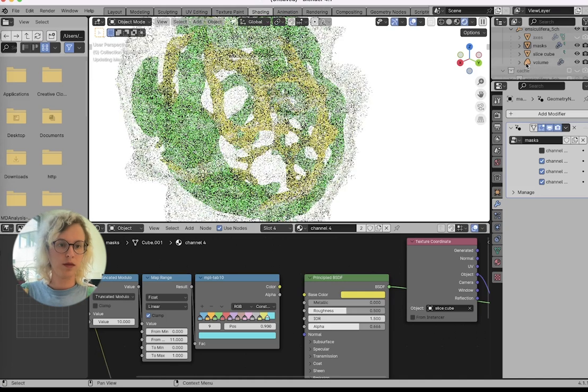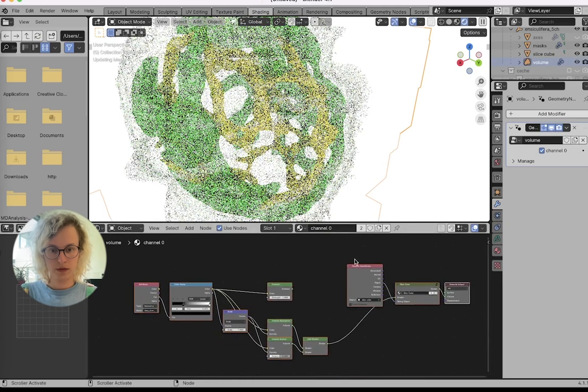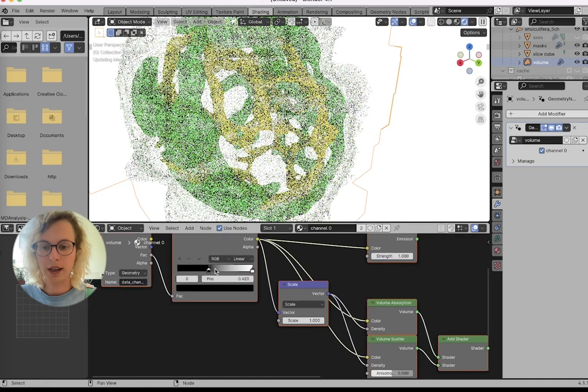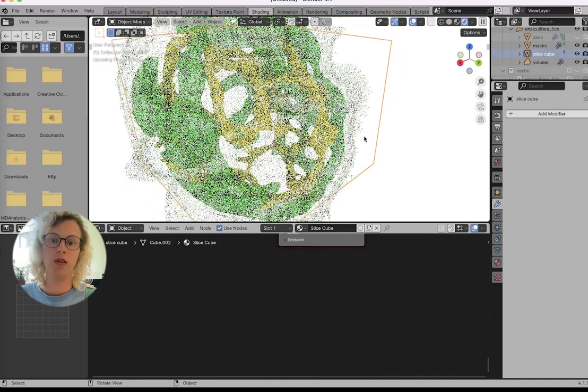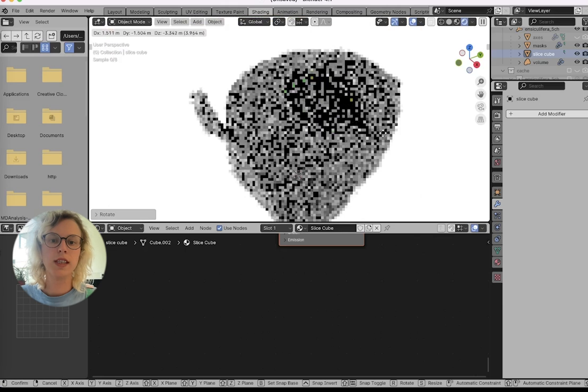So if we turn the volume back on, we need to redo its shading as well. Still thinking about where it is. So I'm going to reproduce what I had in the last video, which looked around here, and slicing this around here.